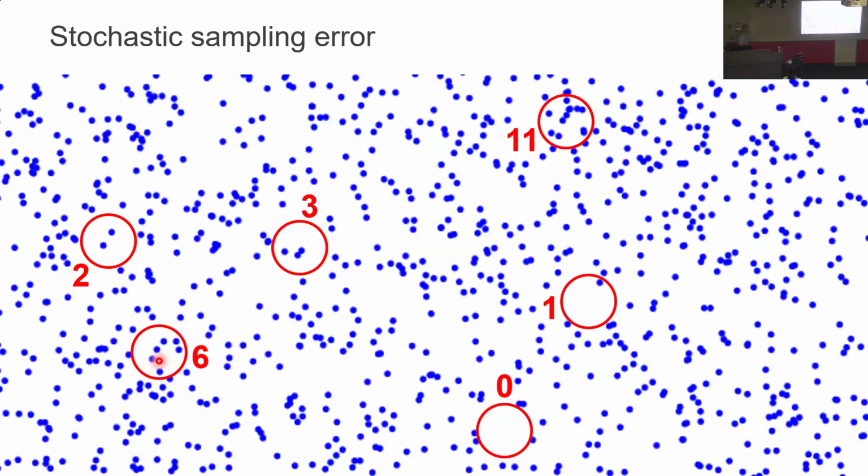I went to a water testing place once. I won't tell you where. I'm not naming any names. And I had a bit of an argument because they said, we run 60 cycles, sometimes 70 cycles. I said, no, come on. You only need to run 35 cycles and you're at the one copy number range. No, it's important we do. And sometimes we need it. And I said, what? So you're detecting less than one molecule? And they said, yes, we are.